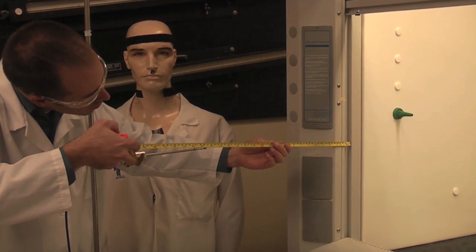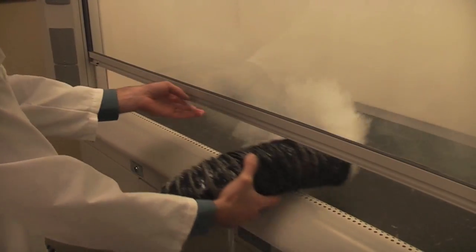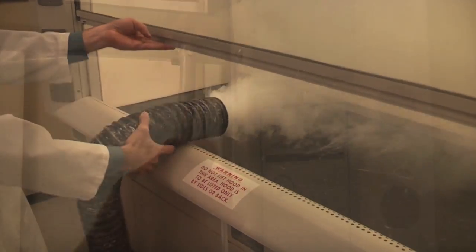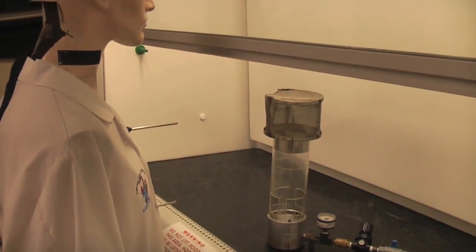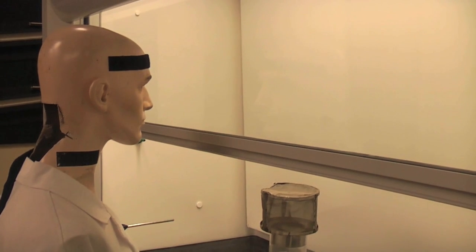ASHRAE 110 1995 testing helps determine the efficiency of a fume hood to capture contaminants under a set of strict conditions. These tests are used to evaluate LabConco fume hoods to ensure proper protection.